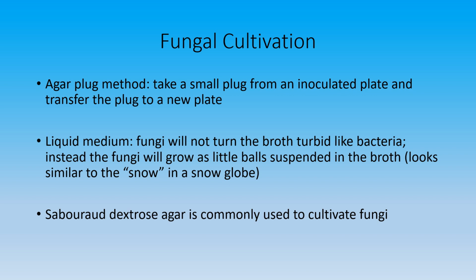Now, in some teaching labs, to remove a plug, they may actually use a straw to stab into your first plate that's already inoculated, and that's how they grab a plug and then push the plug out onto the new plate.